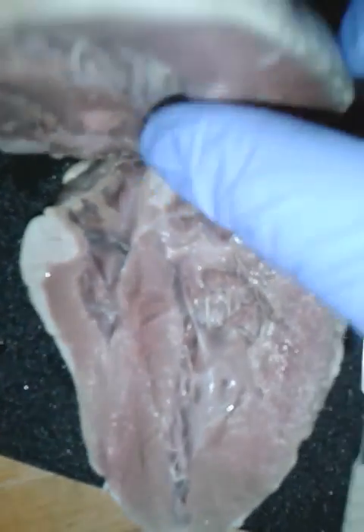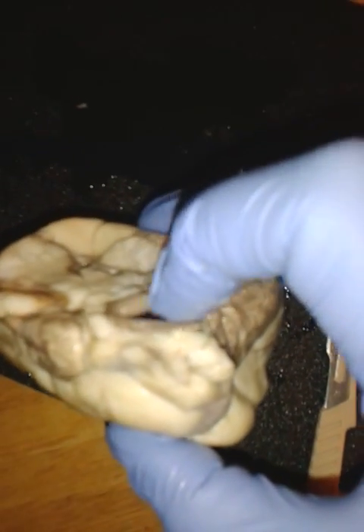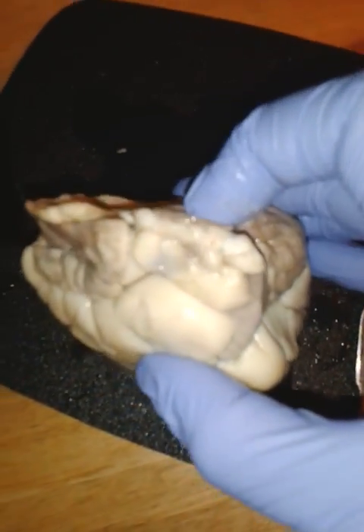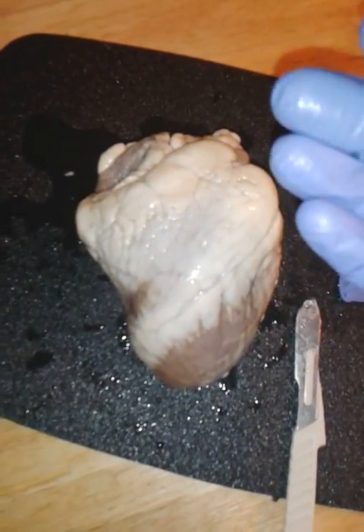And then the aorta contains the same structure, a semilunar valve, which prevents blood flow from the aorta back into the left ventricle. And that concludes our dissection of the heart.